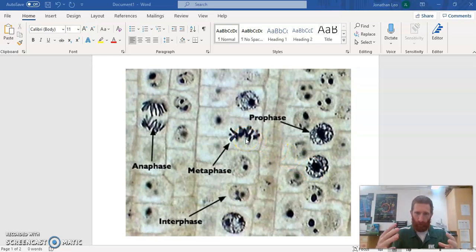Right, so let's start with the phase that you'll see most often, interphase, because that's the longest phase of the cell cycle. We talked about how there are different levels of condensing of DNA, from just the double helix, the genes that are being used, all the way down into the most compact, most condensed chromosomes. So right here we would see a nucleus of a cell in interphase, and we can't really tell if it's in G1, S, or G2 because we don't see any chromosomes. It's just all spread out and strung out, and it's not tightly compacted into the box, into the moving truck, right?